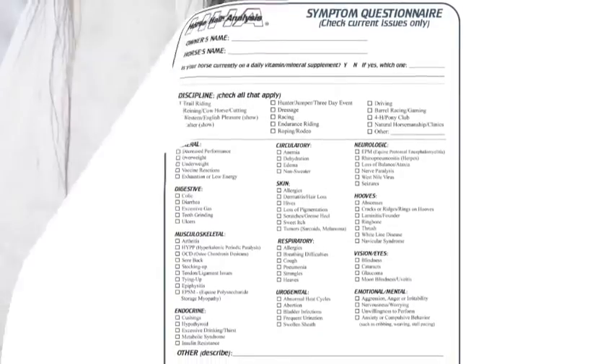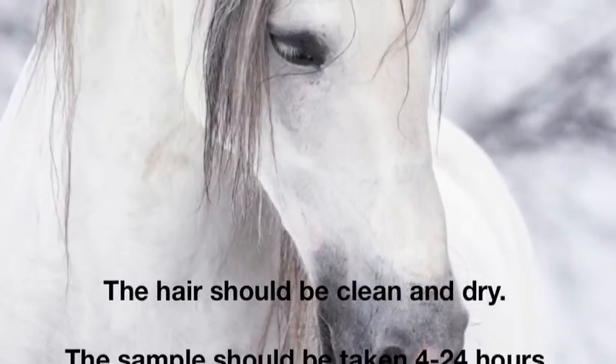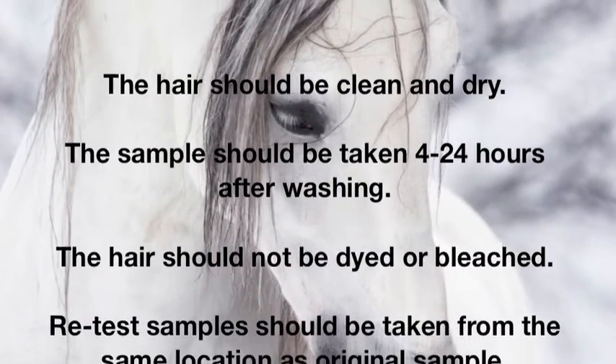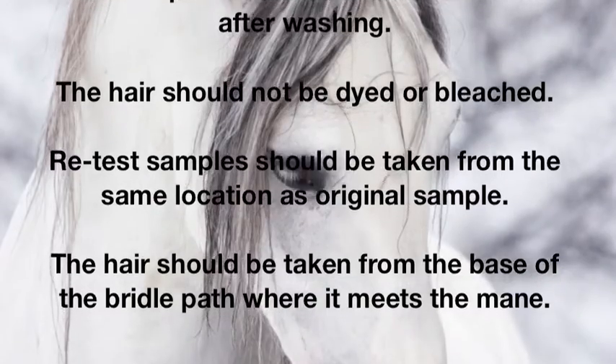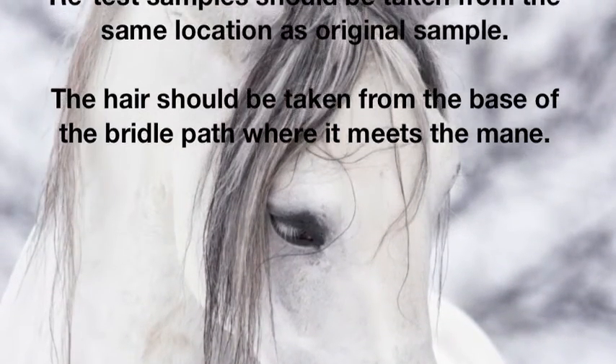For best quality results, the hair should be clean and dry. The sample should be taken between four and 24 hours after washing, and the hair should not be dyed or bleached. Retest samples should be taken from the same area as the original sample. Hair should be taken from the base of the bridle path where it meets the mane.